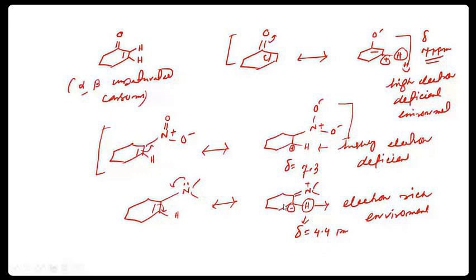In the next part, we'll discuss the coupling in NMR, because coupling is a fundamental and very sensitive technique inside NMR. By analyzing this coupling, you can say which kind of proton is attached there and the number of protons. As this is a very fundamental topic, in this class I will not elaborate it that much. We'll cover it at a very basic level. After gaining that knowledge, in the next class we'll see how to determine structure by NMR spectroscopy.